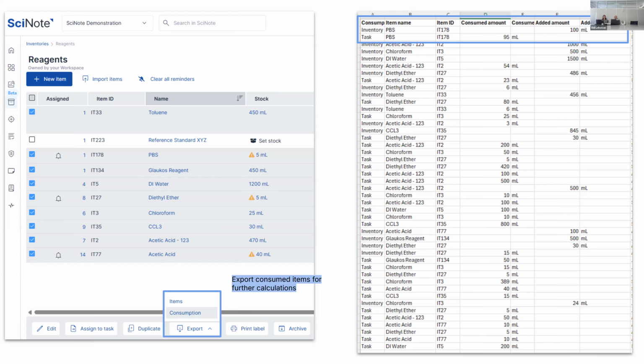And what happens here is you can see that this is a screenshot from my inventory, and the specific item now carries this information forever, that it was used on this contact plate sampling, and it has a timestamp. You always know who used it, when they used it, and you can also see in the experimental records why they used it as well. Very important that this information does not get lost, and it really creates this long-term traceability.